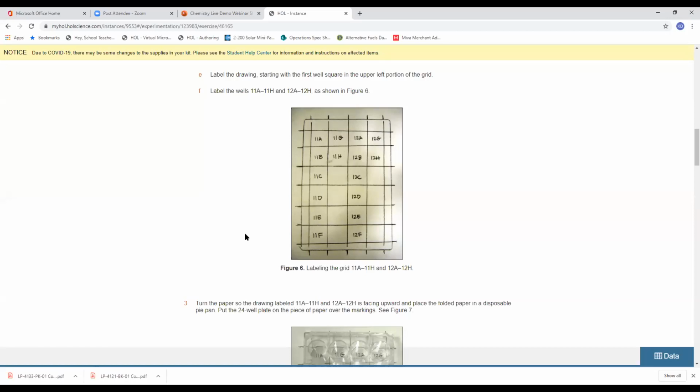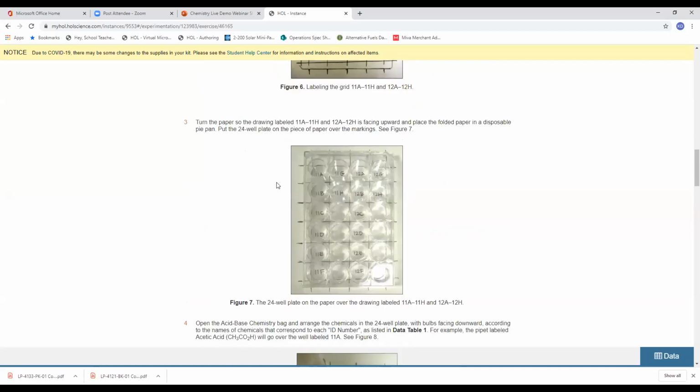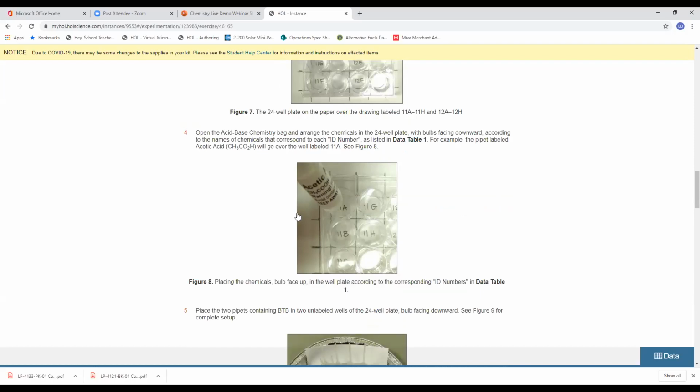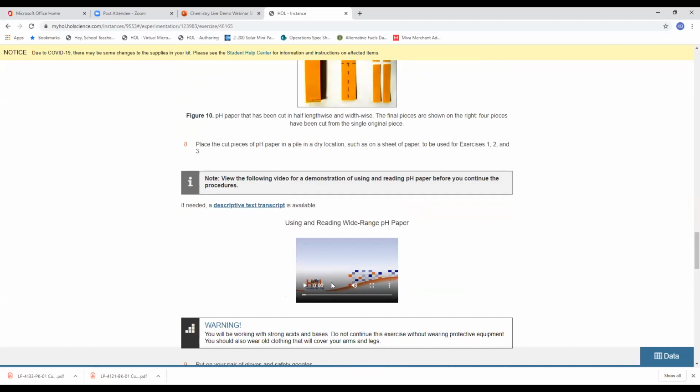So because these remote students can't get immediate answers, it is imperative that we reduce any questions that they might have. And we do that by writing very purposeful steps, beginning with verbs, very short in nature, and always following those up with photographs of the actual materials and protocols that the student is using. Here you see a student distributing some of this particular compound in one or more wells, and it shows the student how to prepare and then how to actually interpret and use pH paper. We've included a video for them.